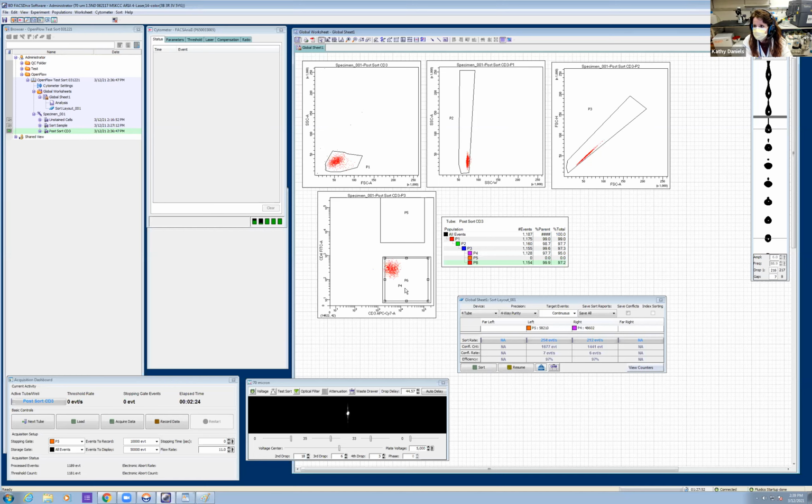I think with these sessions, we've really been looking at how the sorter gets set up to sort. Some of the issues around how we handle our samples and what we do with our cells afterwards, we might try and cover in the next session when we look more at practicalities and troubleshooting.